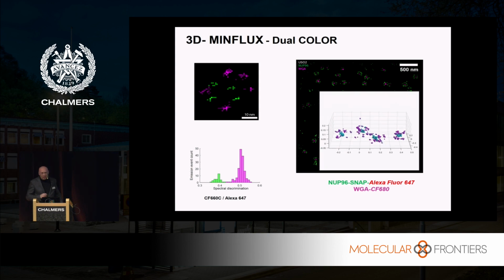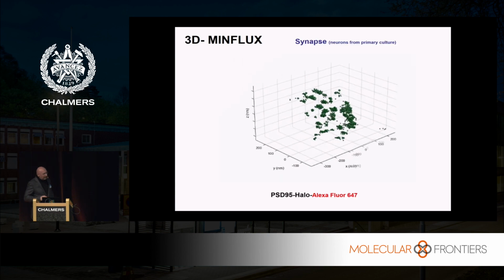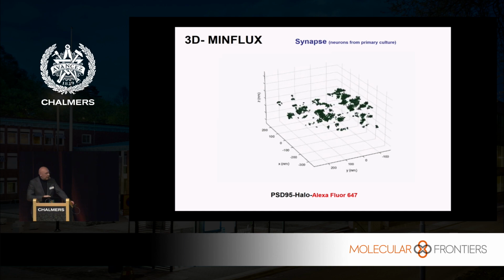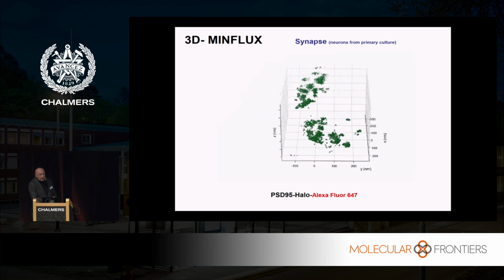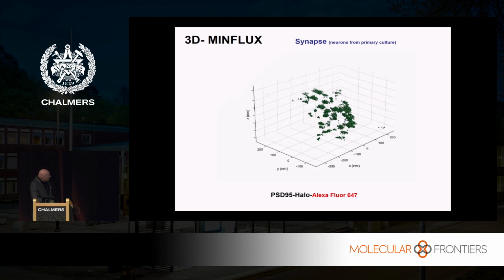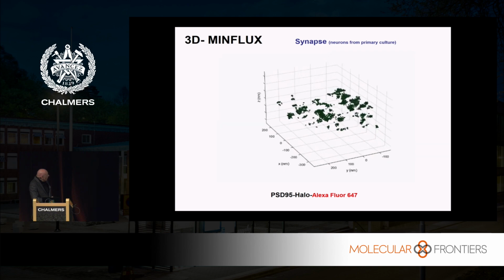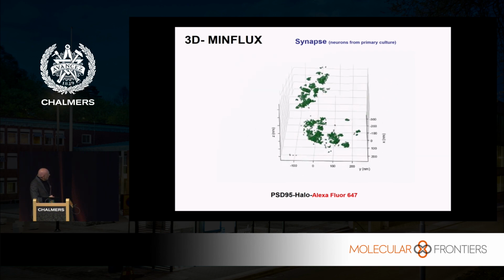But it's important engineering, because in the end, the biologists want to use it and they want to get pictures in 3D. They want to find out something biologically interesting or medically relevant, but I'm sure they will, because the resolution increase is now so much over the diffraction barrier that I have no doubt that major discoveries will be made in the life sciences as a result of this fundamental change that has happened in the last 20 years. And so this is a 3D rendition, of course, of a certain protein in the synapse.